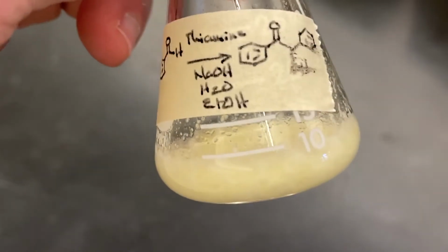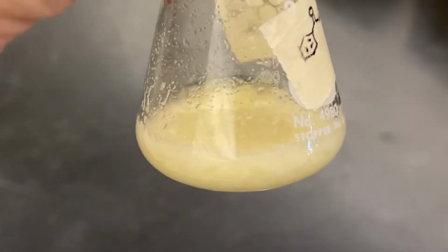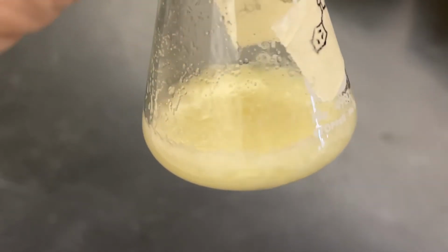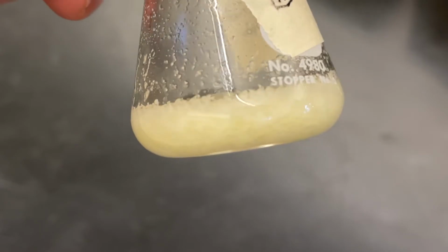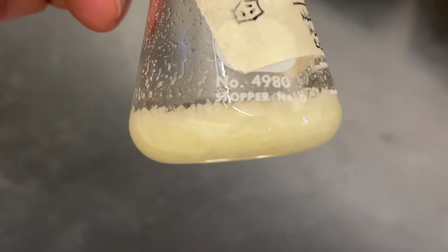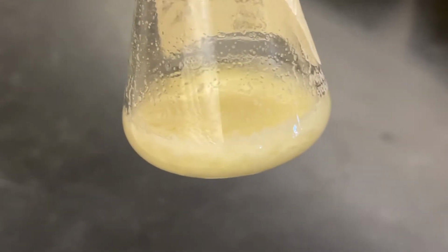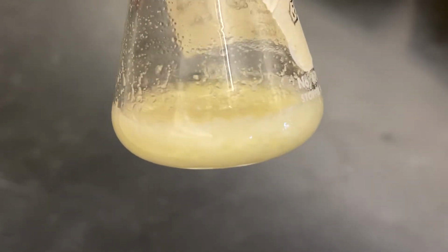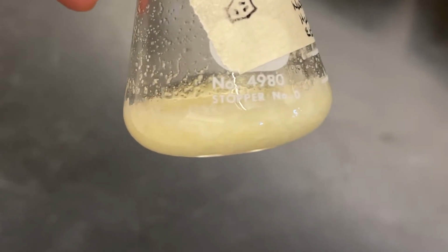All right, here we are. We've got our benzoin synthesis, and we're taking a look at it, and yes, it has solidified. However, I had the time lapse on it, and I was trying to catch that solidification as it precipitated out over the 2 days, and that did not work. The material was still liquid when I took a look at it, so there was nothing to see there.